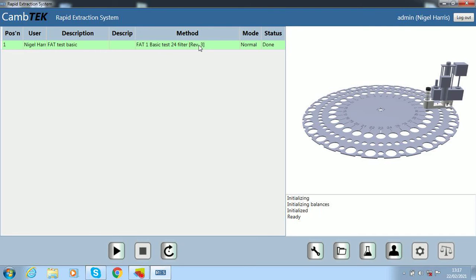If you create a method, every single change you make to that method is catalogued. Okay, you cannot change that. The system captures everything that you do. It is a fully compliant audit trail.